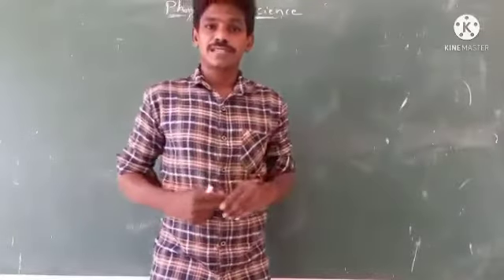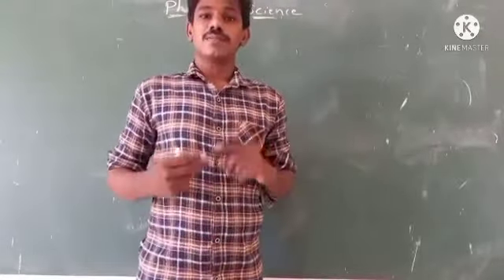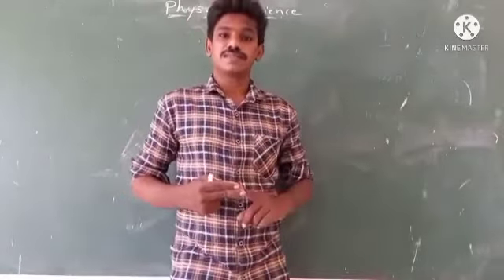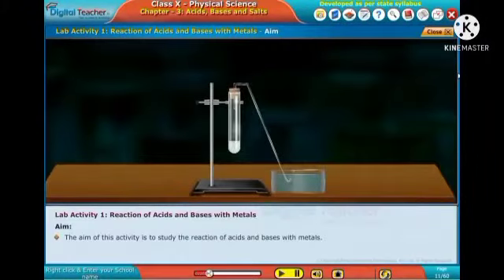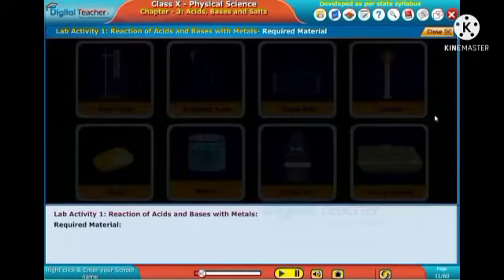That activity is the reaction of acid and base with metal. Let us see the activity. The aim of the activity is the reaction of acids and bases with metals.